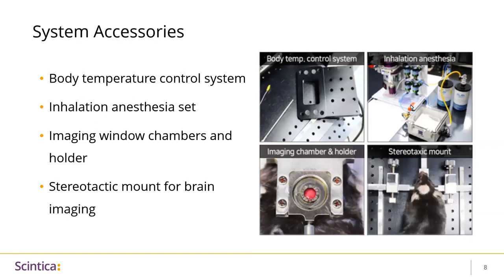There are unique accessories associated with this system. There is a body temperature control system, and an inhalation anesthesia set which is custom-designed for this instrument. If you have used anesthetic agents with window chambers in the past, you would know that it's hard to fit the nose cone and the window chamber together, so all these components have been optimized to work well with the window chambers. There are also imaging window chambers and holders shown at the bottom left.